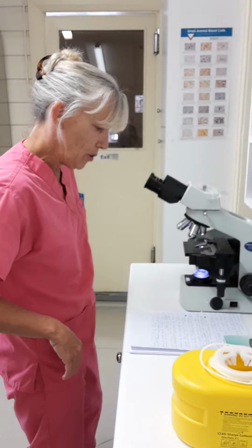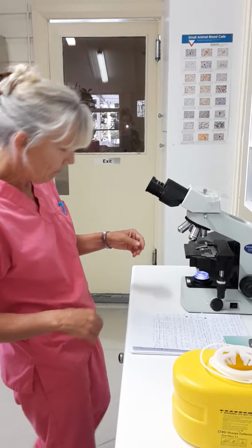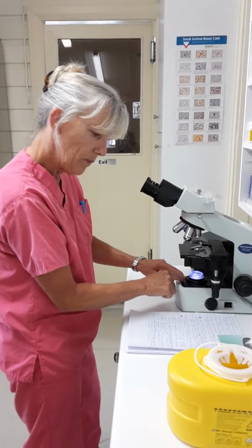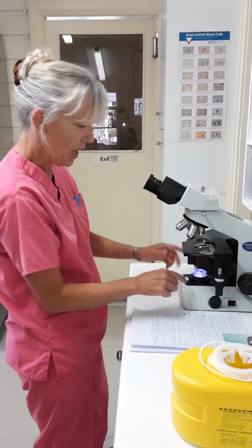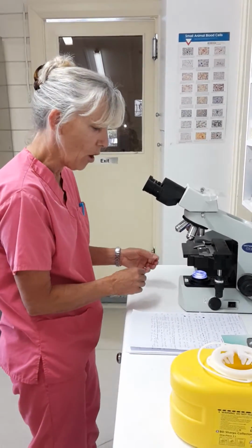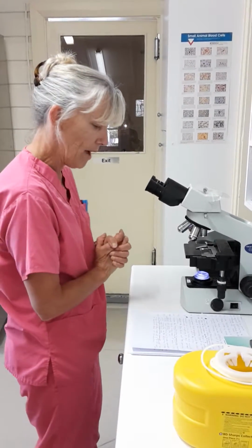The next thing we're going to do is dial the field diaphragm, which is this part here, if we had one, to reduce the view to 1/3, and we would have a hexagon-like shape in our frame. We actually don't have this because our machine is different and it's old, so there's a couple of steps in here that I just have to make believe that we have.